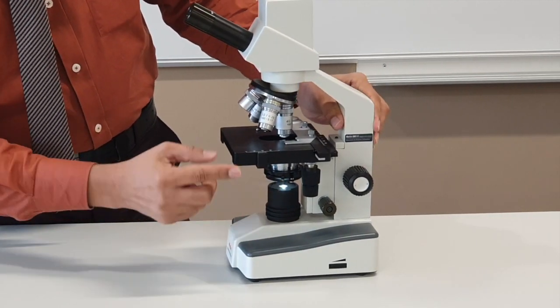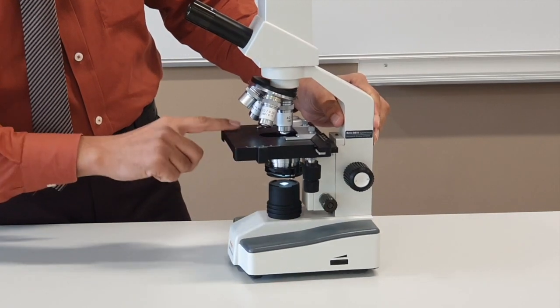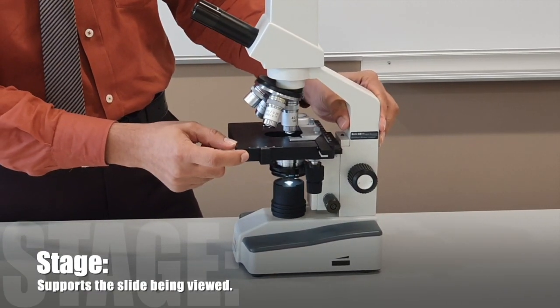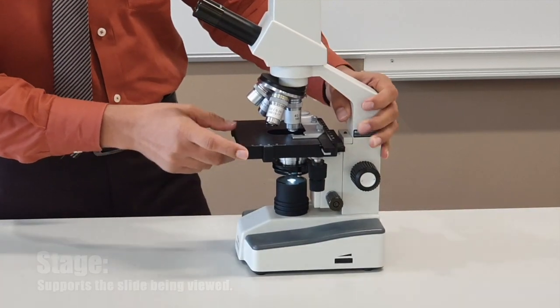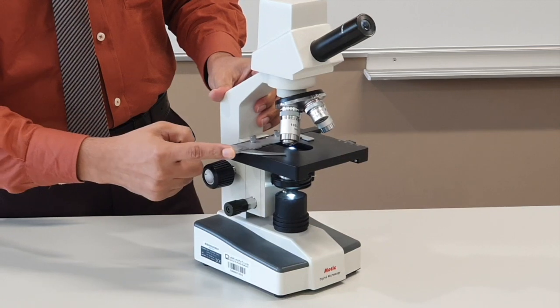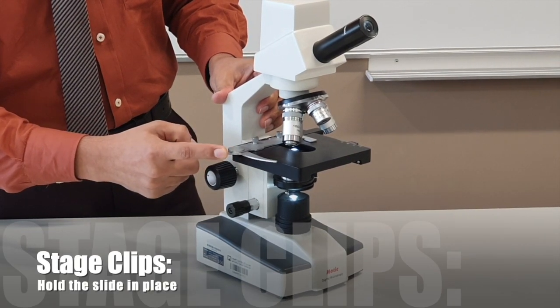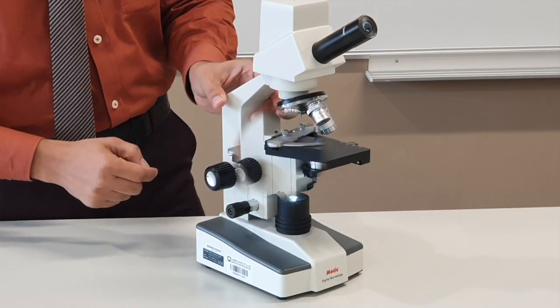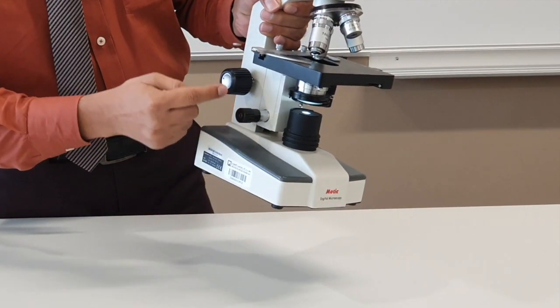Above that, just above the diaphragm, we have this area. This is called the stage, where you place your slide or specimen. The stage has these clips. These are called stage clips that hold the slide in place on the microscope.